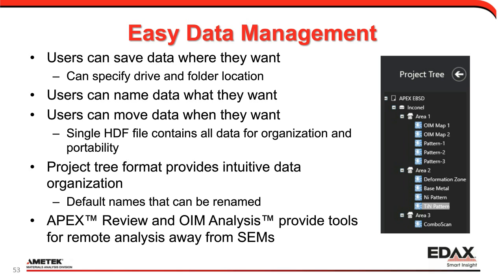So the data can now be saved into a single HDF5 file. HDF5 is a hierarchical data format file that allows us to basically create a project tree in the data file itself. As we have a single file, we can move it from one computer to the other just as a single file without having to worry, did I forget something, did I leave something behind?